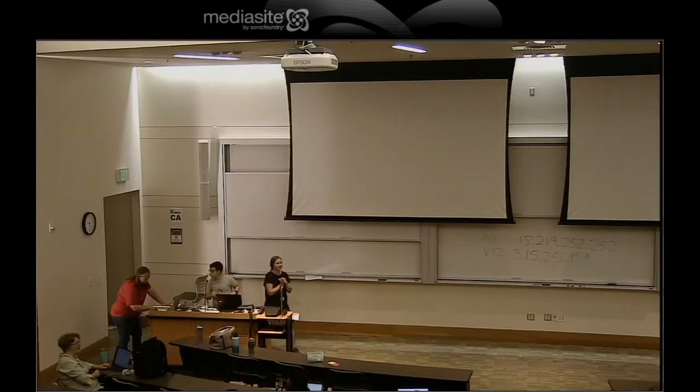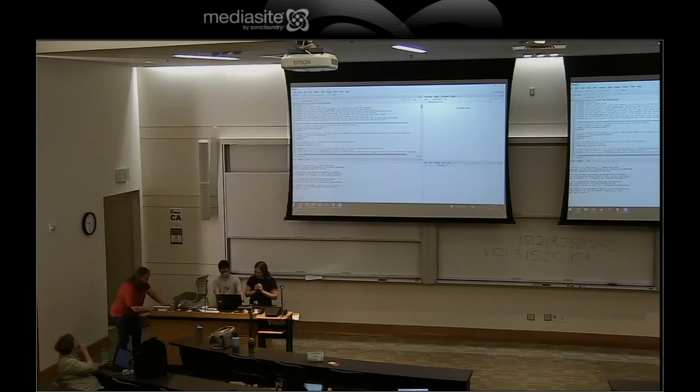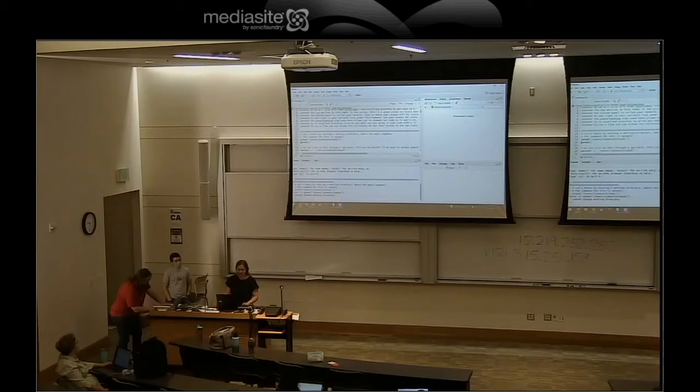Our machine was fine. So what you guys can do is, oh good, I have my thing open too, go to a line. She has downloaded Learning R from the website and opened it. You can go to this line, say I want to run this line, set working directory, which this directory will not exist on Lynn's computer, which is totally fine for now. I can hit Control Enter, it'll take me to the next line and run it, okay?